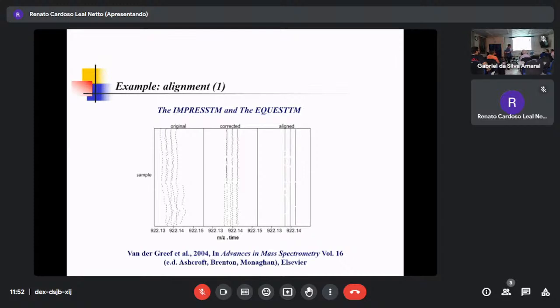That's why NMR signals also fluctuate a lot. Not as much as chromatography, but it's 1 ppm, 0.99 ppm, or 1.1 ppm. Some people want to apply this alignment algorithm to the NMR signal. The problem is NMR is within 0 to around 10 ppm, and a lot of the signals are crowded. Sometimes with this kind of signal, if you align, then you lose the information.